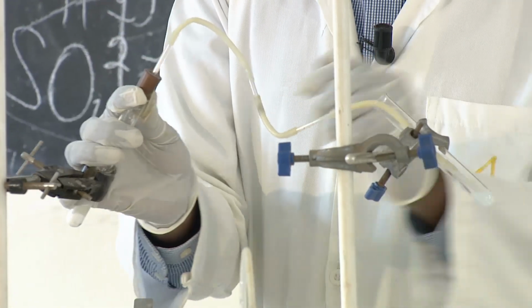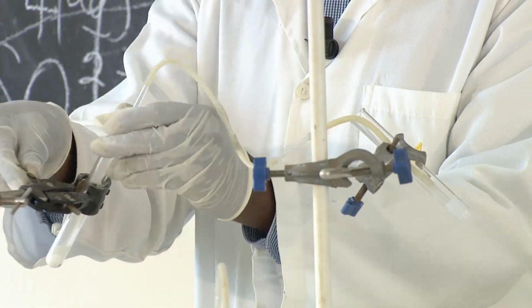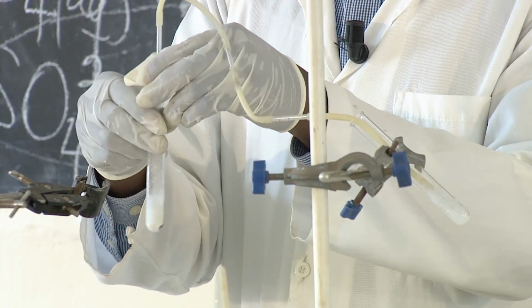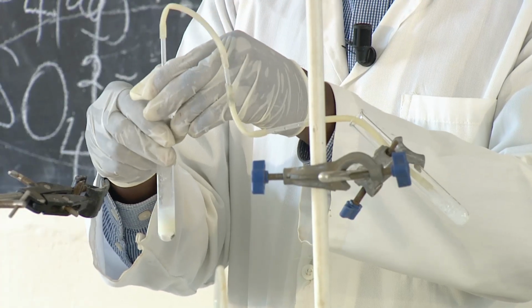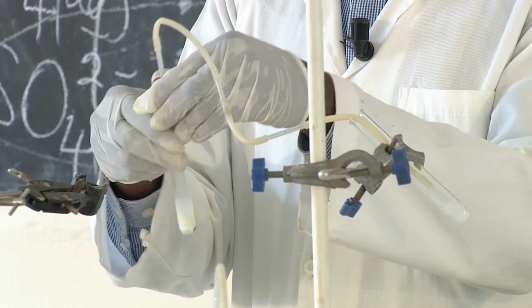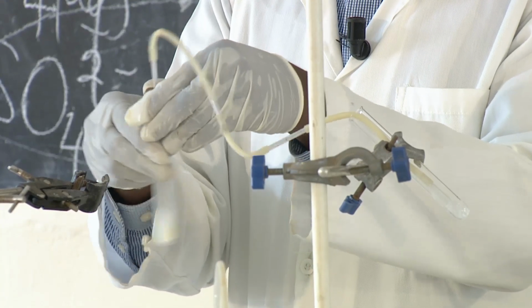You have to make sure the gas doesn't disappear. The gas is still coming. You see, when I shake, more gas comes out. So that means I'm increasing the rate of the reaction.